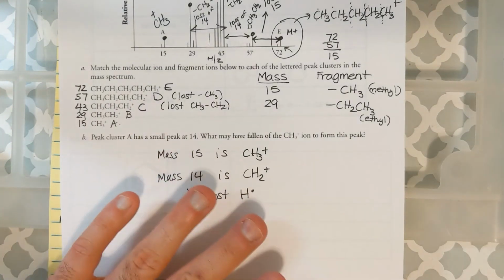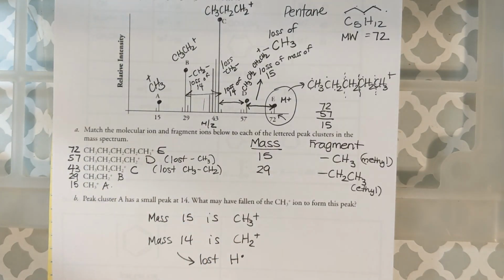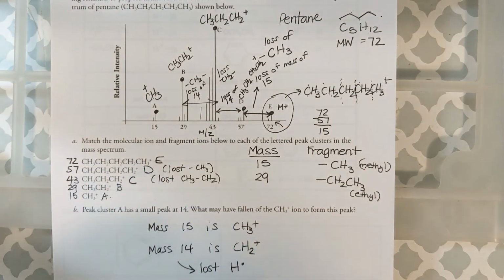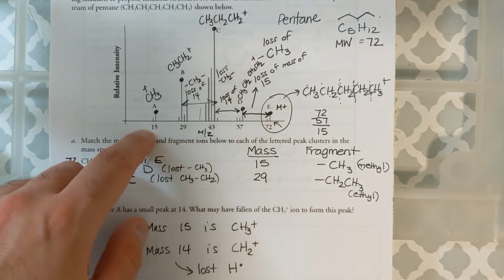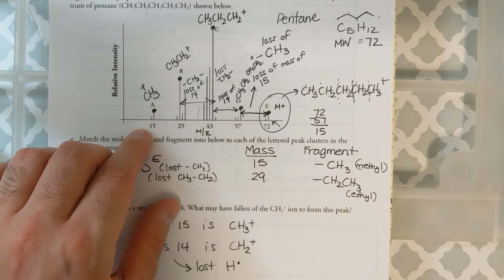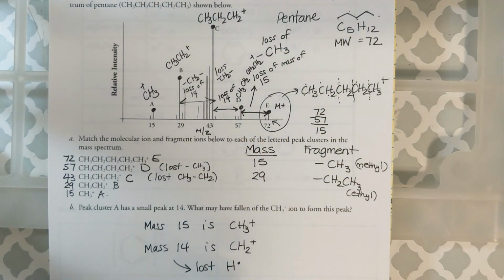And then we ended with talking about how we interpret all the different peaks in a mass spectra, and each of the peaks corresponds to specific fragments. What you will eventually get is you're going to see what the masses correspond to, and I gave you some very important ones. 15 and 29 are big in organic chemistry. But what you'll see is you'll have a list of masses and what fragments they correspond to, and that's going to help you build and create your structures.